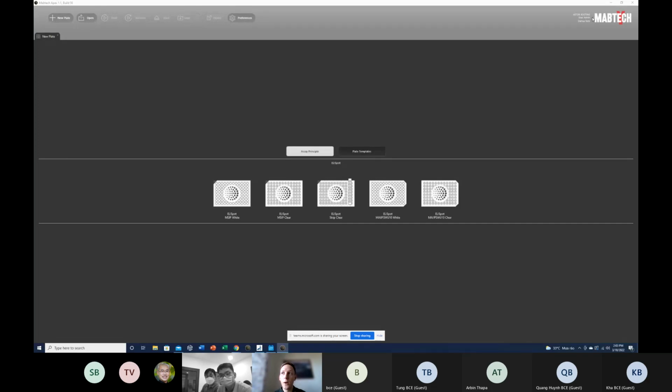If you are connecting the cable and you make some sort of mistake and a cable is not connected properly, then it will say here, no reader connected. So then you know that something is going on with the cables. So that could always be a good way to confirm that everything has been set up properly. Okay. But now I think it says ASTOR ready, right?